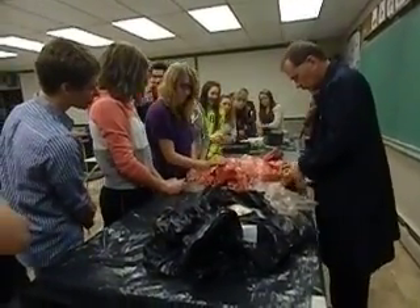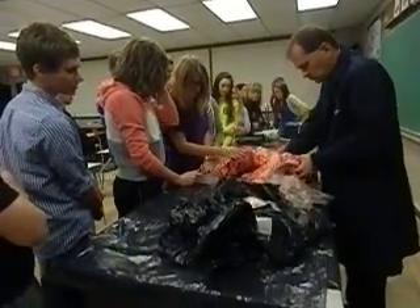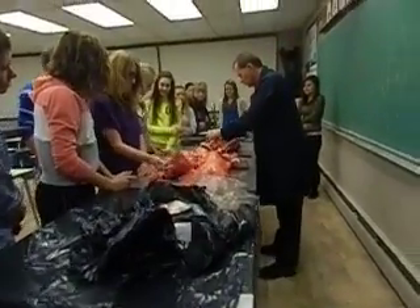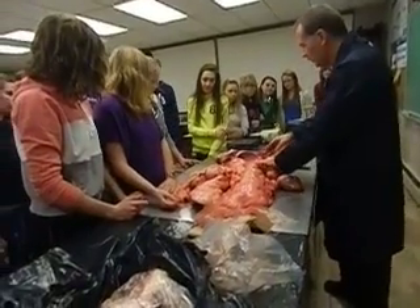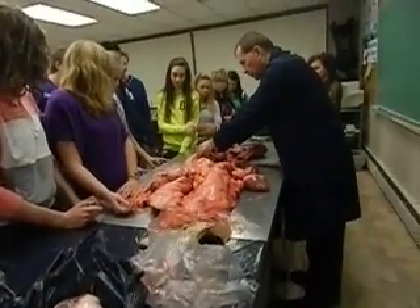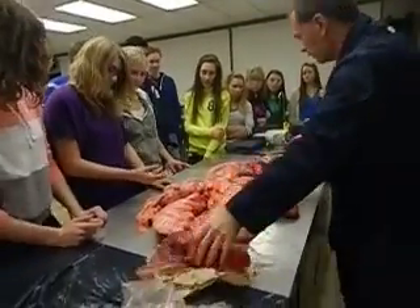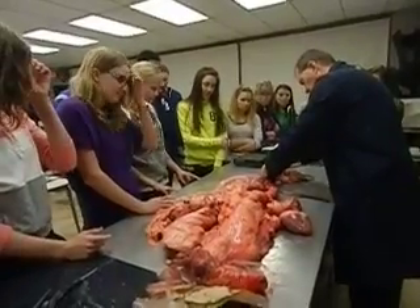They gave me another set of lungs — this is a set of lungs from a pig. Oh, and the heart's even actually still attached. I didn't know that I was going to get that as well. This one looks a little more clean, looks intact. Let's see what these look like when they're inflated.